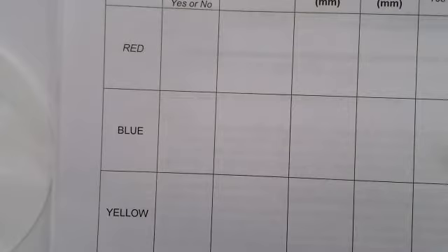Now, if perchance there's a broken M&M, please go ahead and toss it. So I tried to go through and separate all the broken ones. And by broken, I mean it has the chocolate exposed. Just go ahead and toss that and don't use it as one of yours.